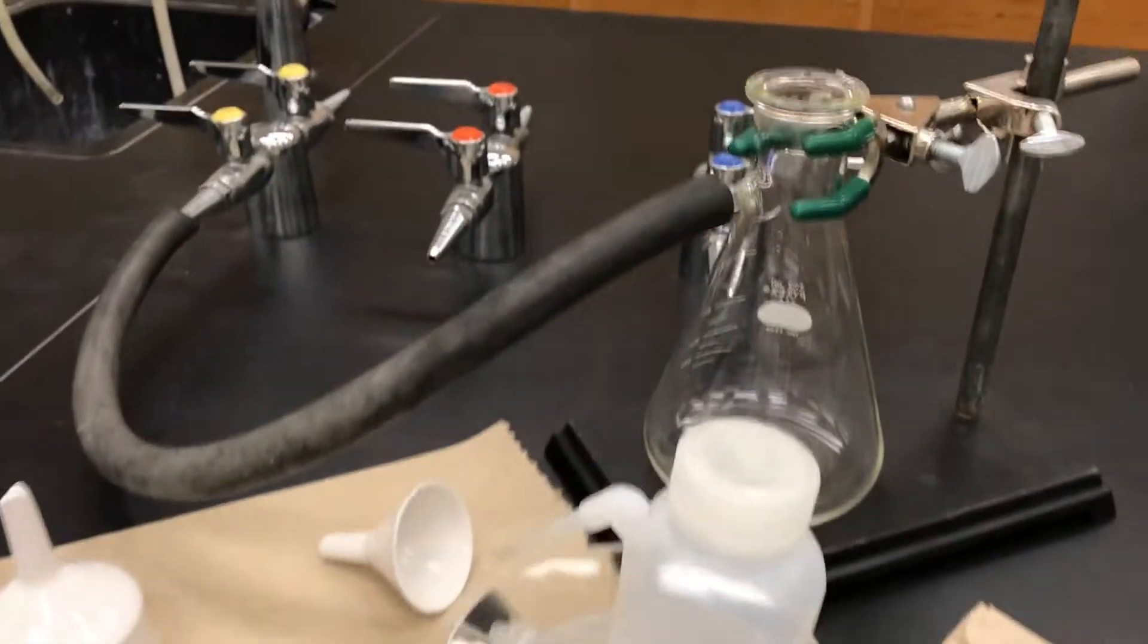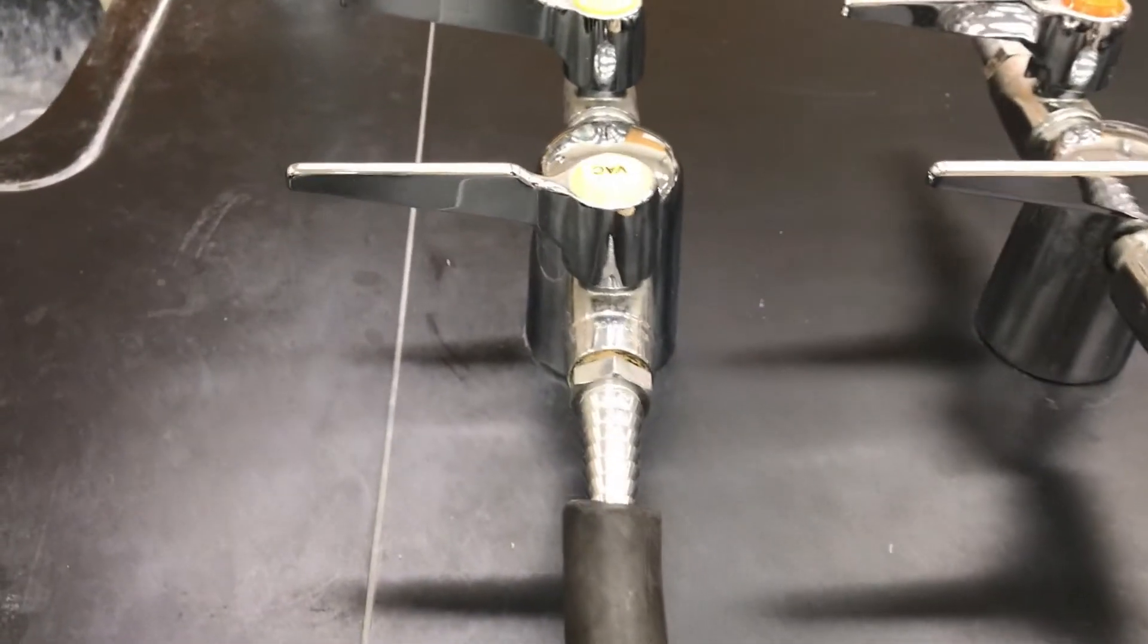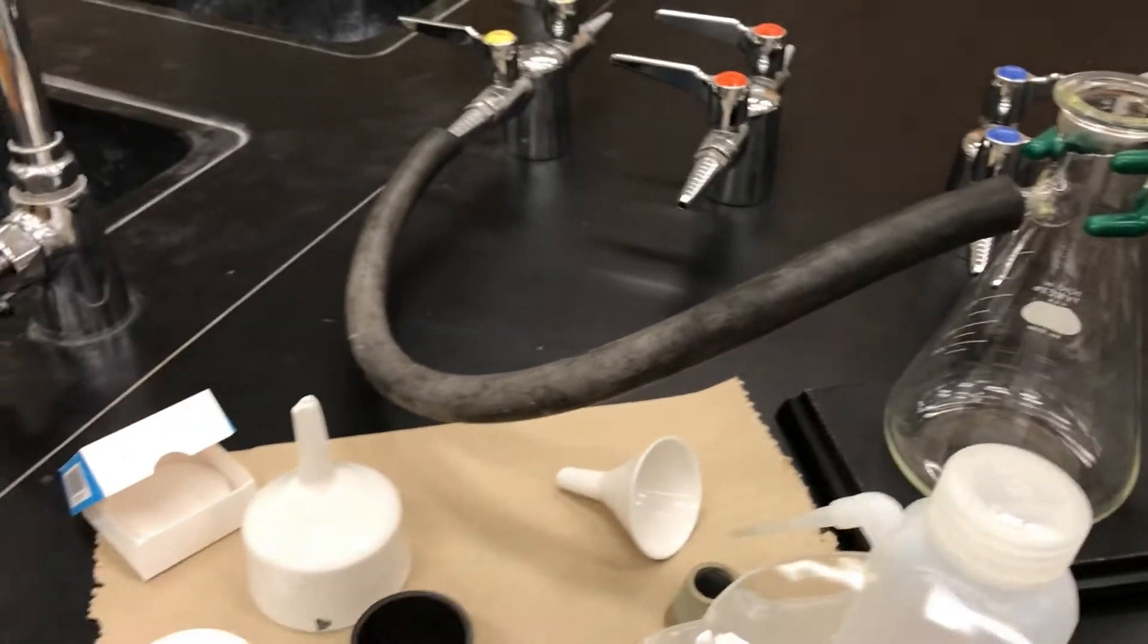So let me set up my filtration apparatus. I'll connect a filter flask to a ring stand and then use a thick rubber tubing to connect the sidearm to the house vacuum.